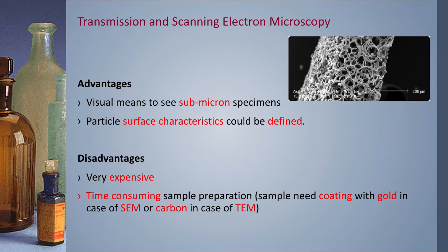And also during coating, there is a certain degree of overheating. Maybe the temperature may reach 40 or 50 degrees during coating, especially coating with gold. Some samples have lipid, cetyl alcohol for example, which melts at a temperature of 40 or 45. So the sample itself may melt, and if the sample melts, of course, you cannot measure any size because all particles will fuse together.